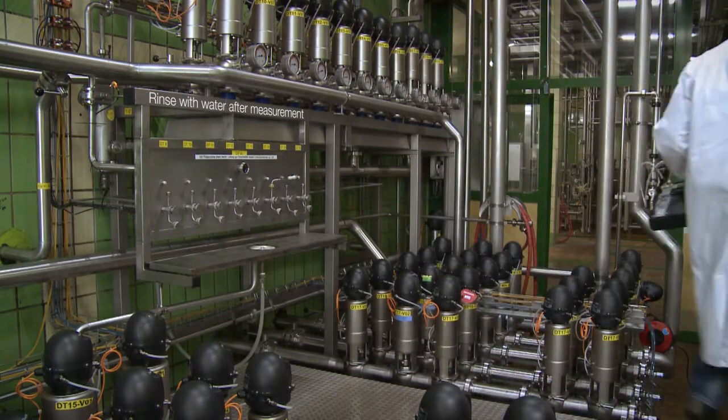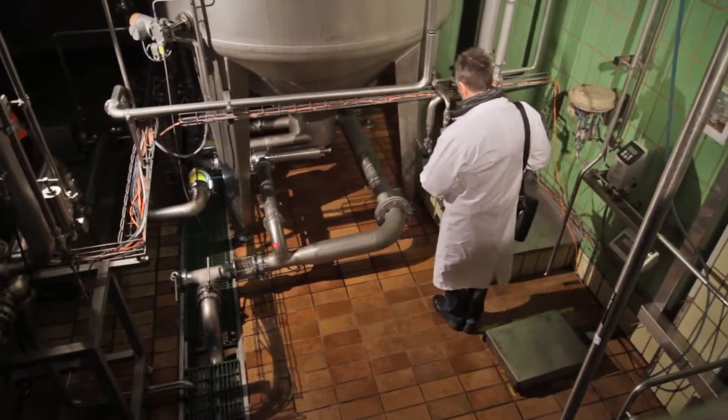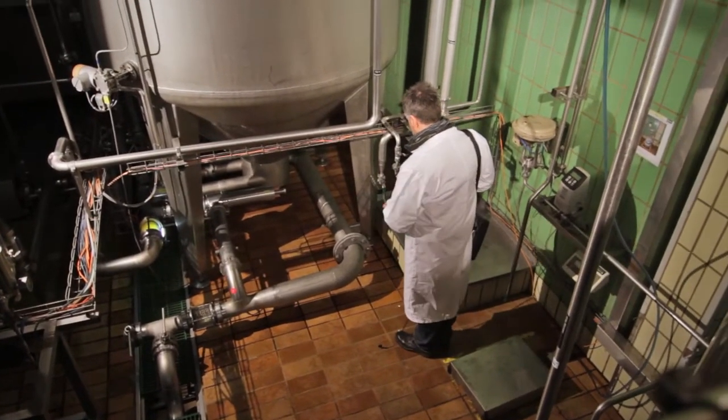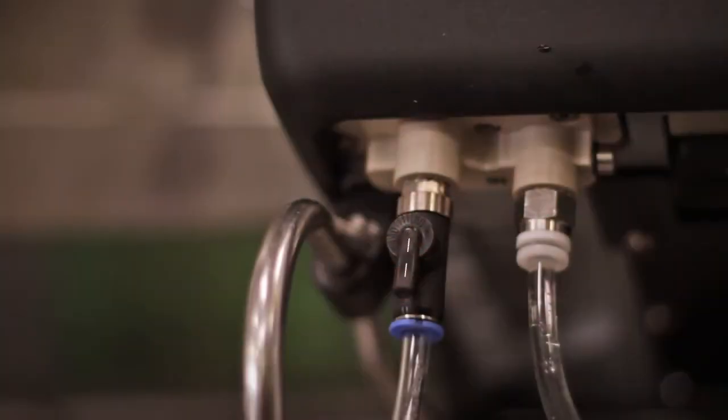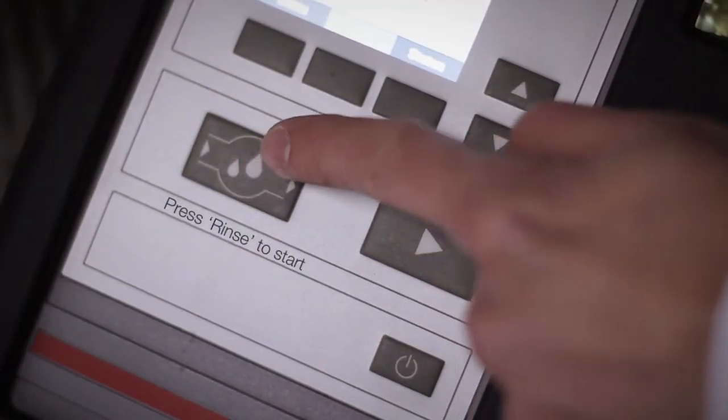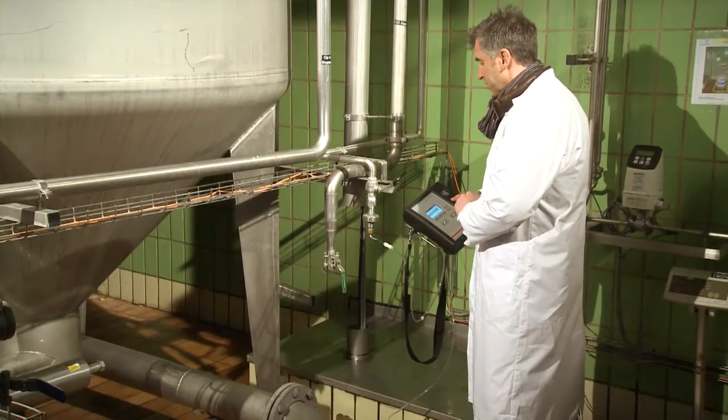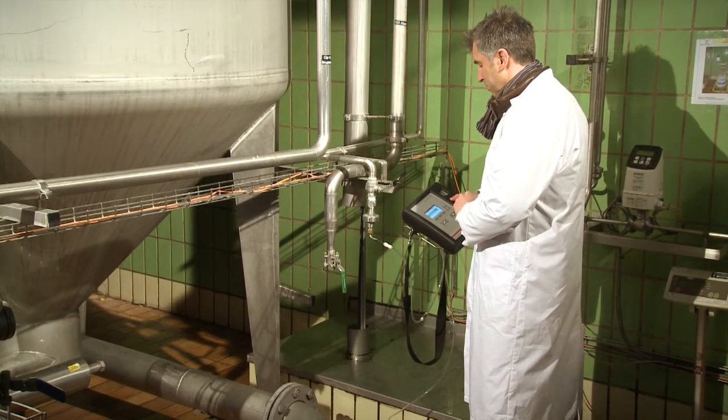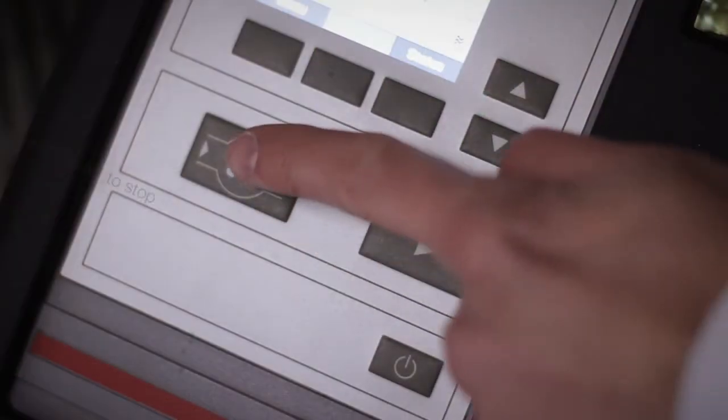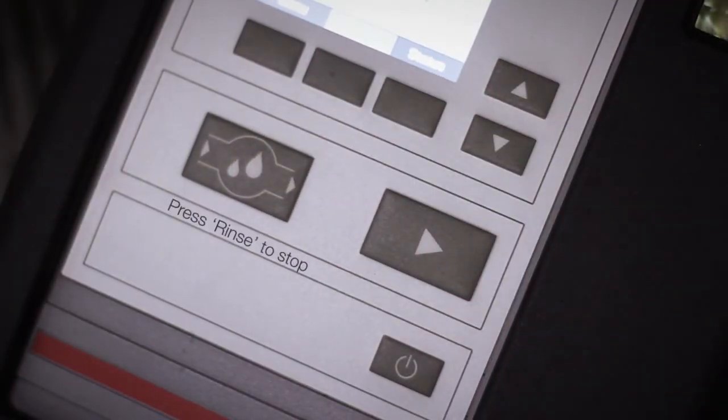Return to the water line to rinse with CO2-free and chlorine-free process water. Fix the ball valve in the back as in the position you see here and press the Rinse button. All sample residues are replaced by water. Press the Rinse button again to terminate the procedure.